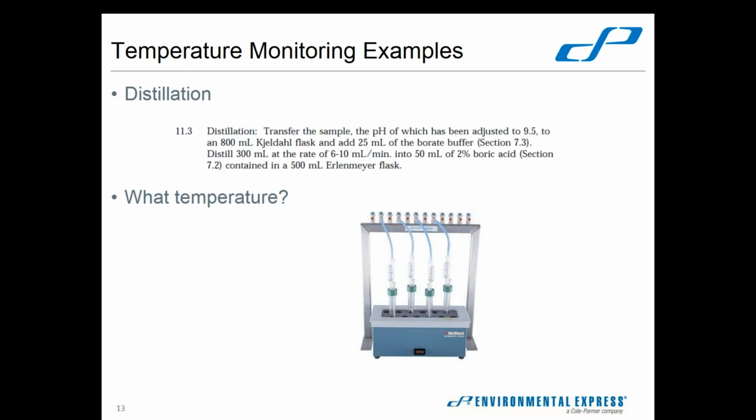Distillation is simply evaporating a lower boiling substance from a higher boiling substance. So what you need to do is raise the temperature of your sample to boiling. And as long as your sample is boiling, you are distilling. So there is no actual temperature requirement for distillations. I've had that discussion with some people recently.